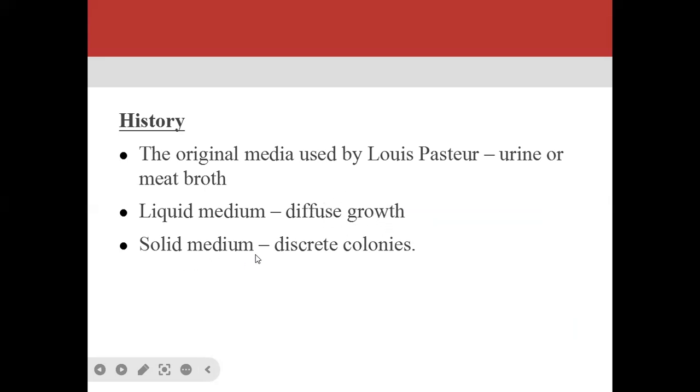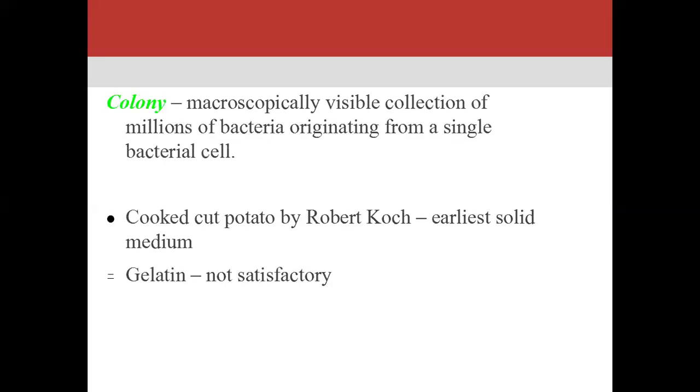And if we use a solid medium, discrete colonies are produced, so that we can easily study the properties of the colonies, such as colony morphology and hemolysis, or any pigment production. So what is meant by colony?